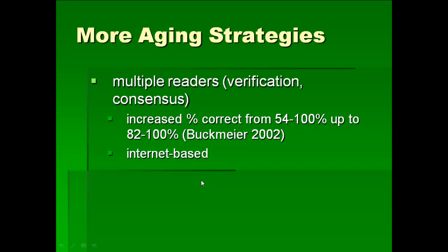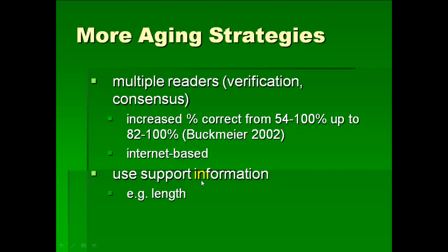You have the possibility to make this internet-based if you're just using digital images, but again, you always want to work at the microscope versus at the computer. Another thing people do to improve aging is to use support information — for example, the length. If you're trying to decide what age a fish is, some people will look at the length to help make the decision. You can see the problem: it's a circular argument. You're talking about age and growth, and then you're looking at growth to help determine age. I think this has real potential to introduce bias, so I don't like it. You're much better off ignoring supplemental information, and if you can't get a consensus on a particular otolith, just throw it out or improve your technique.